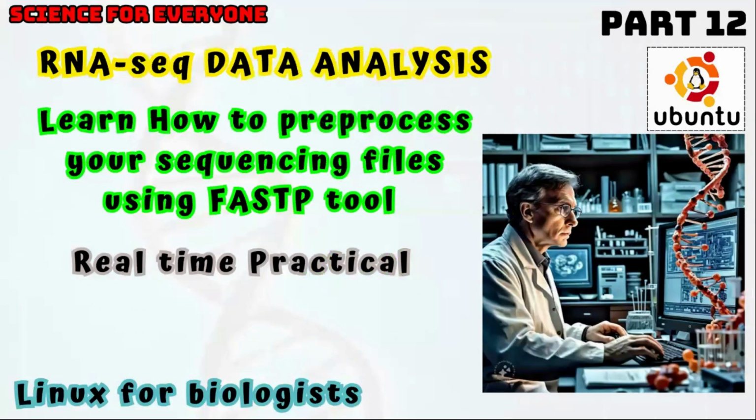Today the video is related to RNA sequencing data analysis, and the title of today's video is how to process sequencing files using Fastp. So basically, this will be a real-time practical. As you all know, I have started a video series related to RNA sequencing data analysis, and this is part 12 of that video series.